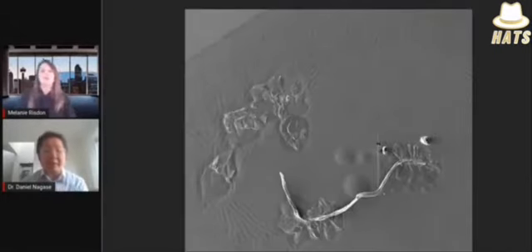Well, the only thing I can say for certainty is all these strange structures we're looking at from the Moderna sample, they're not of biologic origin. So there was no biologic contamination of these samples. Okay.